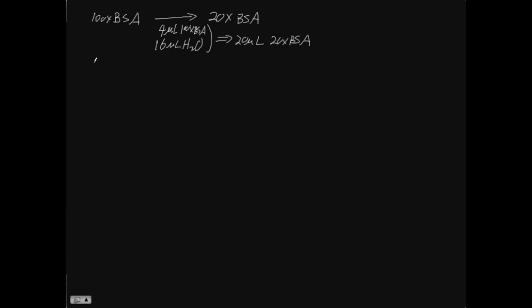And then we need to set up the reaction. The reaction, we have a 10x buffer plus restriction enzyme, that's the highly concentrated one. For every single reaction, we have a total volume of 20 microliter. This means we need to add 2 microliter 10x buffer.